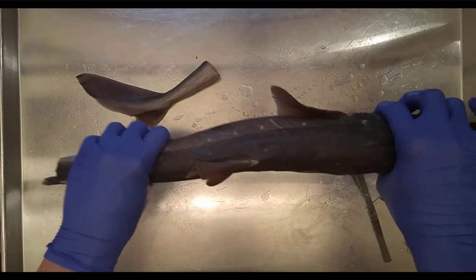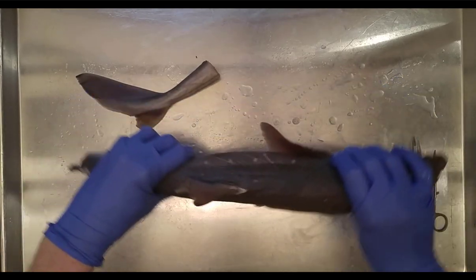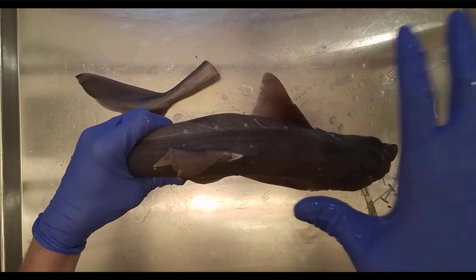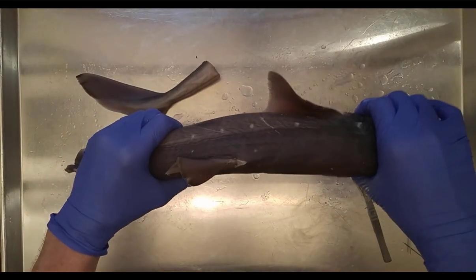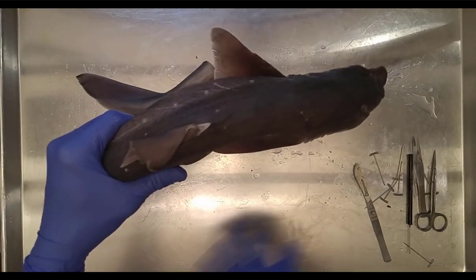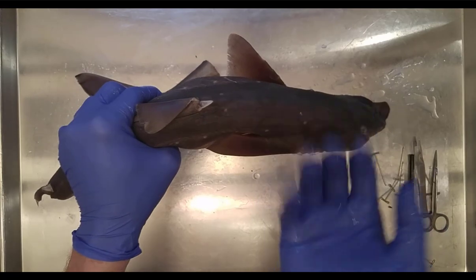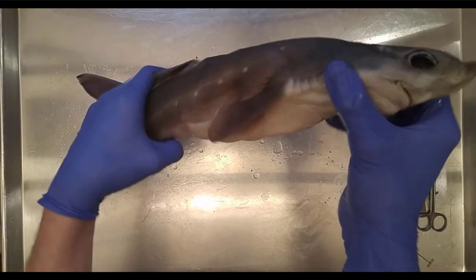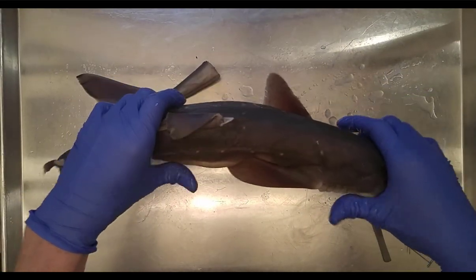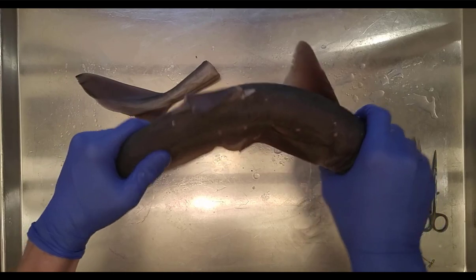You'll notice the shark is dark on top and light on the bottom. This is called countershading — a camouflage feature. If you're a predator looking down, you see the dark dorsal side against the deep dark ocean. If you're a predator looking up toward shallower water, you see the light ventral side against a lighter background. This countershading camouflages the shark from both above and below.